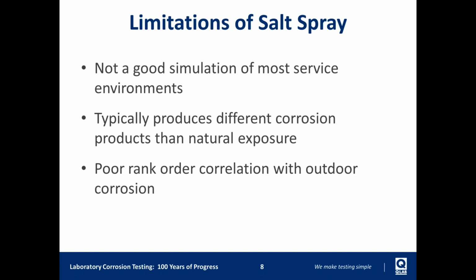Now, the biggest limitation of salt spray is a lot of the failure modes you'll get in salt spray are not realistic. They're not the same thing that's seen in outdoor environments. It's not the same thing that's seen in some of the more modern corrosion test methods. And so it's not really a great indicator of how something's going to perform outdoors. It's still very useful to make sure that it was applied properly. You're looking for catastrophic failures as a quality control test. And also it can be used as a qualification test, comparing it to materials that work outdoors.